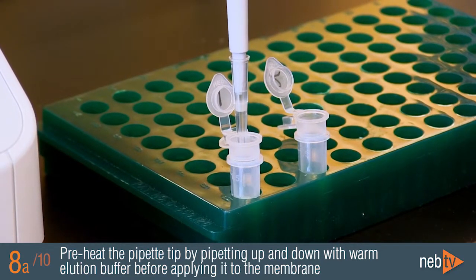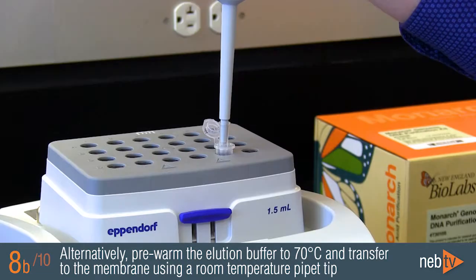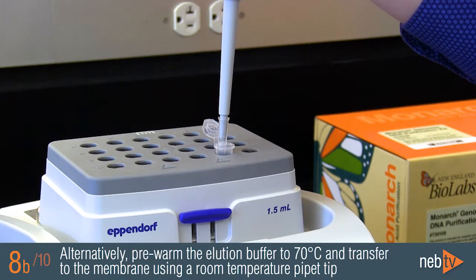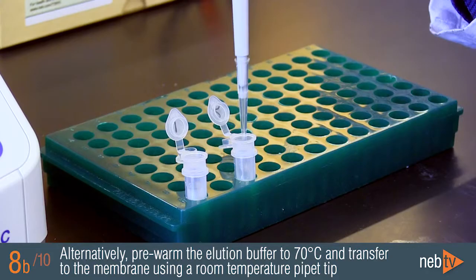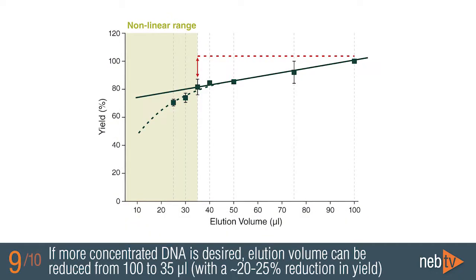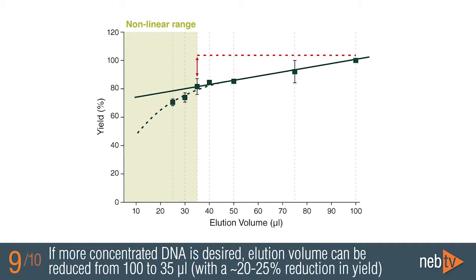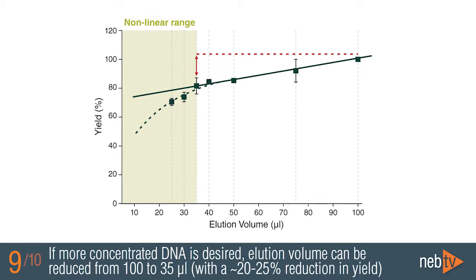The volume of the transferred elution buffer will be slightly larger than 100 microliters when using a pre-warmed tip. Alternatively, you can use elution buffer warmed to 70 degrees with a room temperature pipette tip. We recommend elution with 100 microliters, but you can reduce the elution volume to as low as 35 microliters if you'd like to obtain a more concentrated sample. However, this will lead to a reduction of the total yield by 20 to 25 percent.